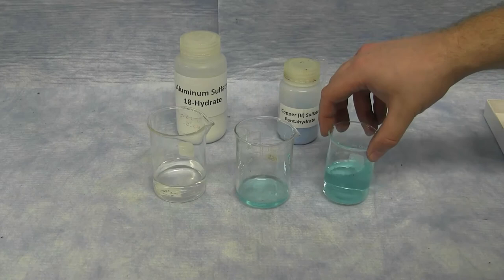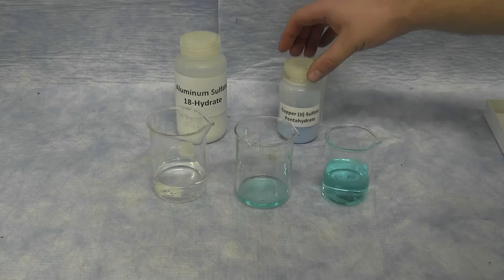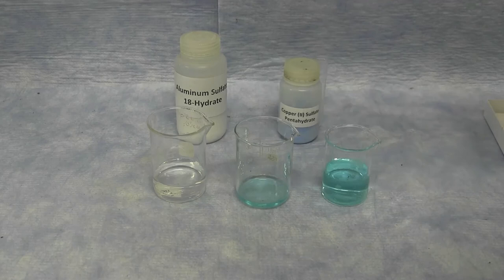Using the provided equation, you can relate the absorbance of the solution with the concentration of the transition metal ion, in this case, the copper 2+ ion. You'll then be comparing what is the calculated concentration of copper 2+ in each of these three solutions, and compare that to the measured concentration using the spectrophotometer.